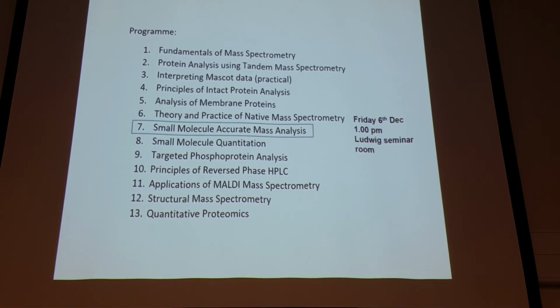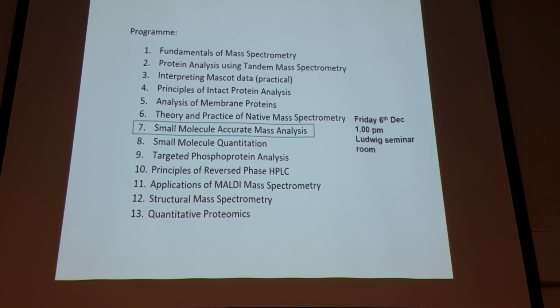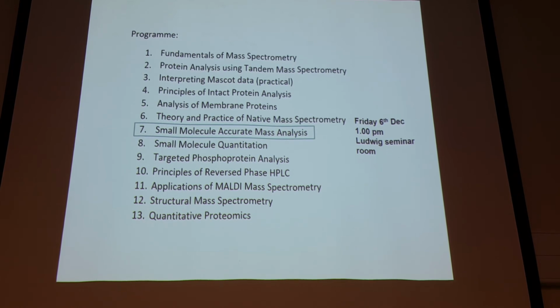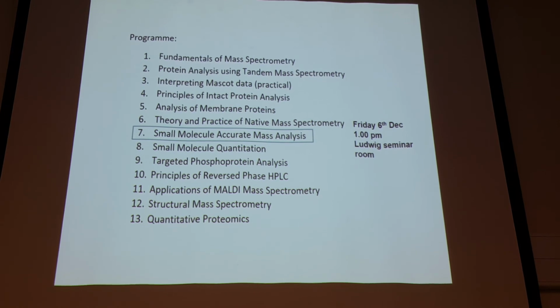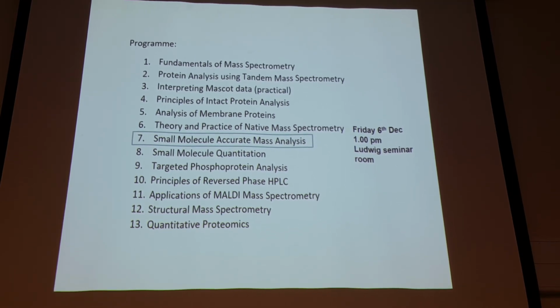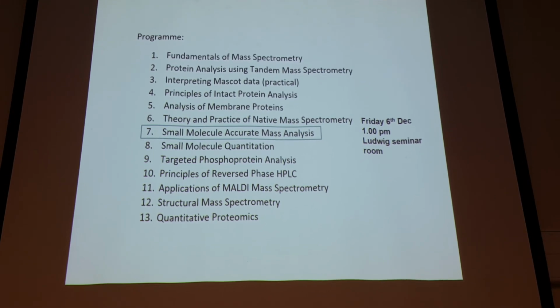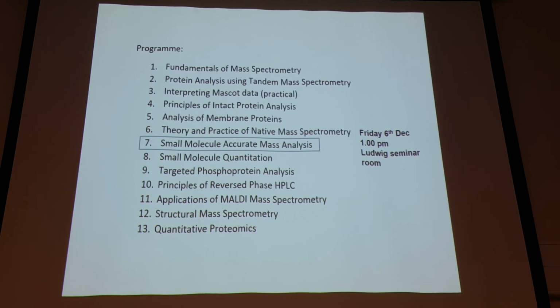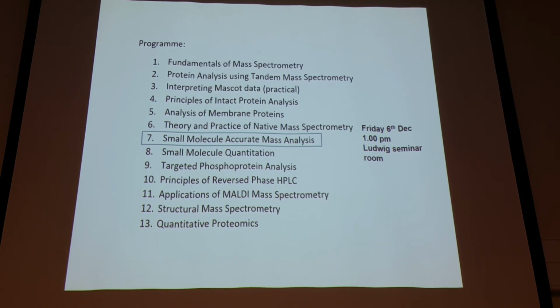So in electrospray, as your solvent droplet desolvates, you are concentrating up the DMSO. So you're shooting your protein at 100% DMSO, pretty much. What we've seen is DMSO changes the structure. I have data on HAL1, you can have a look at it. The structure is actually totally different in the presence of DMSO. So if you're going to use it for screening, I would recommend evaporating off your DMSO and resuspending it in something that is mass spec compatible, like methanol.